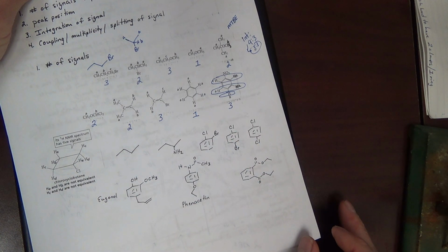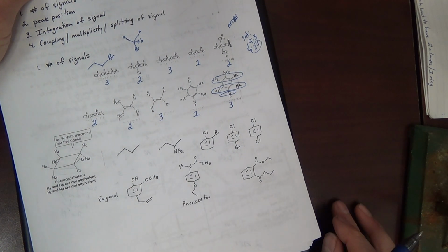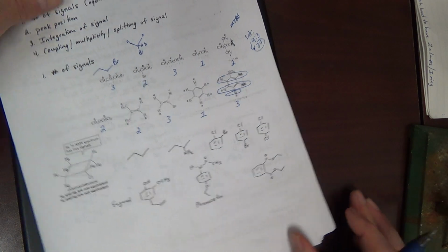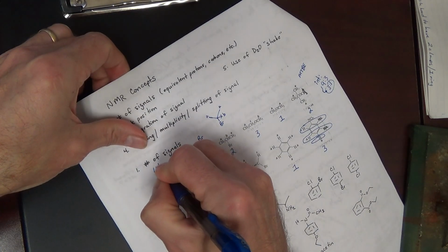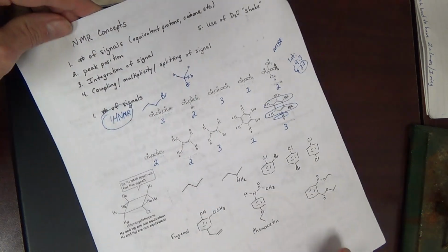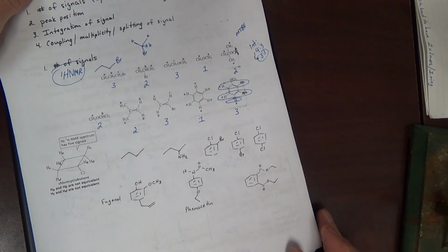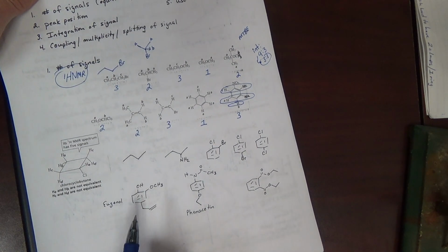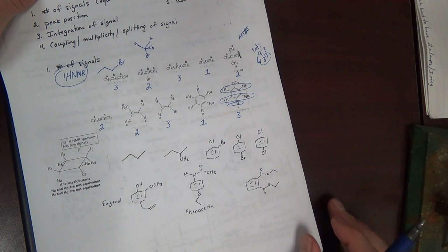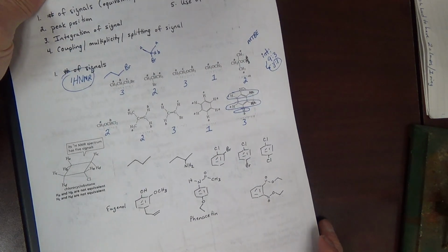Basically, how many signals do you expect for each proton? We're doing 1H. Now eventually we'll look at carbon NMR and we'll focus then on the carbons, but for now let's focus on the hydrogens.